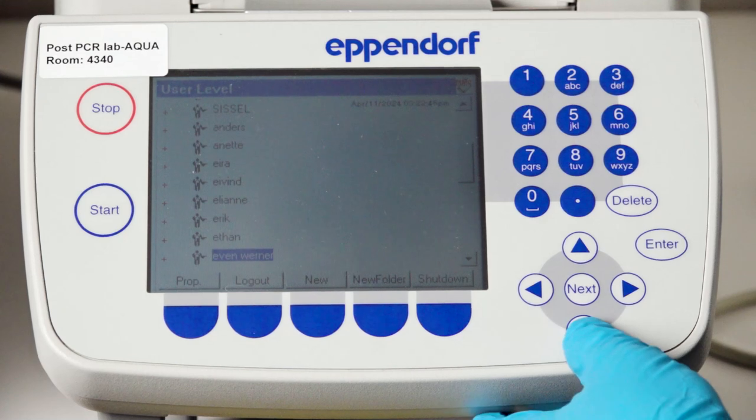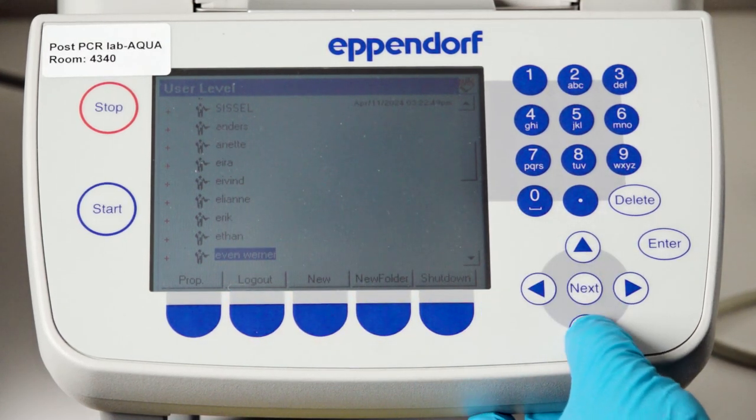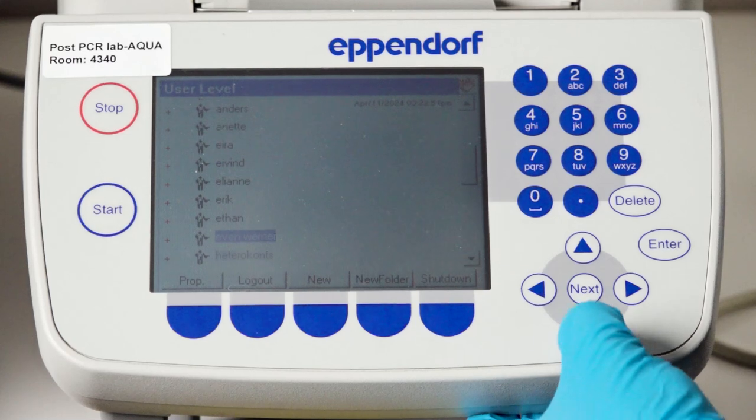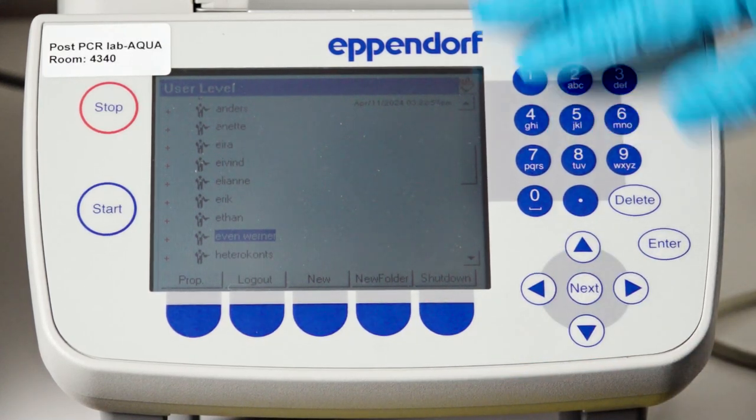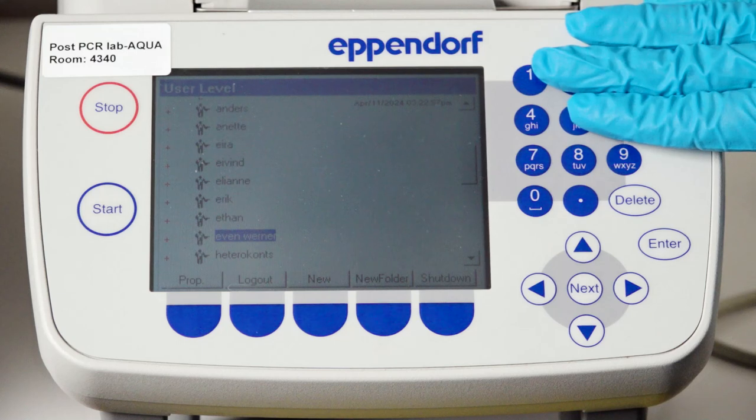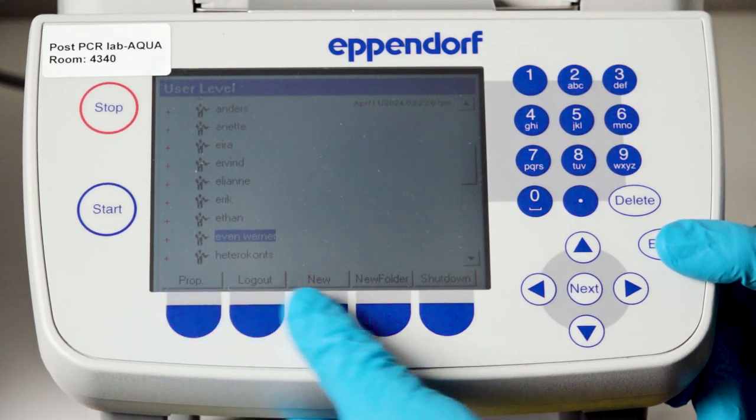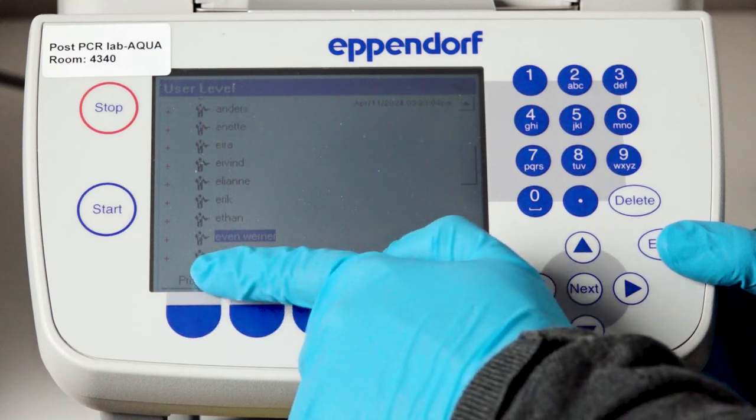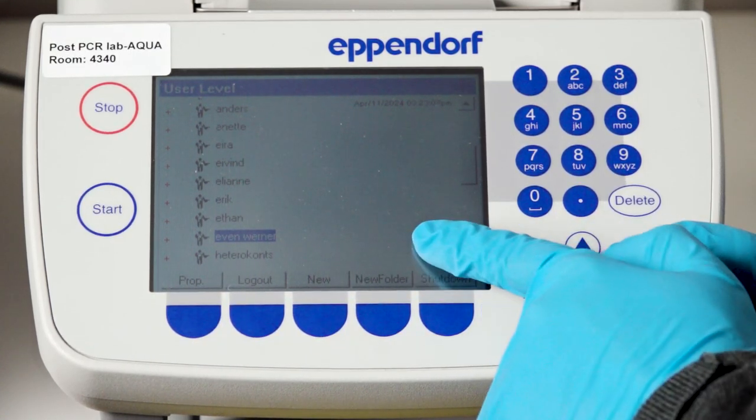Here you see that I'm already selected to my folder. To move around we use the arrows, or if you need to write something we use the keypad over here. For selecting it's enter, but we also have buttons here that correspond to the given menu or options just above it.